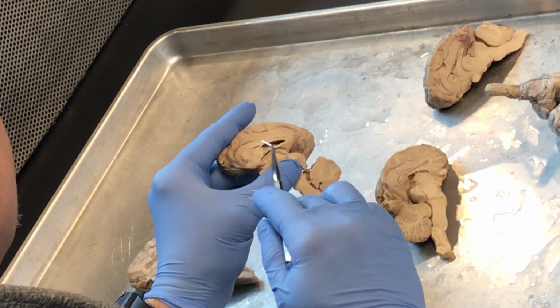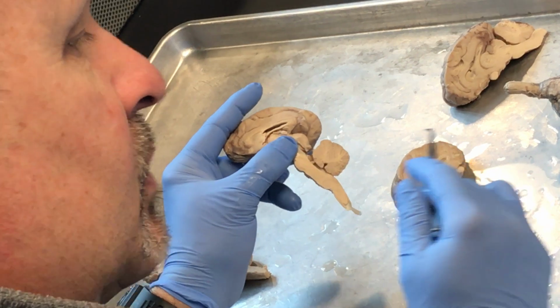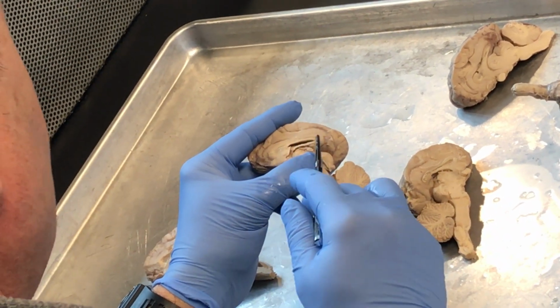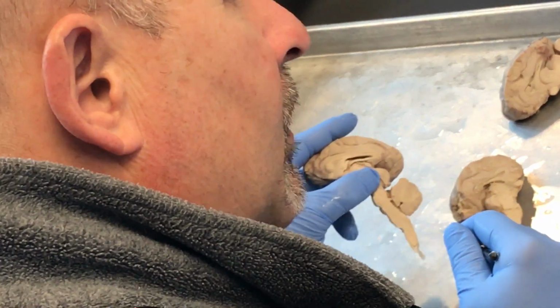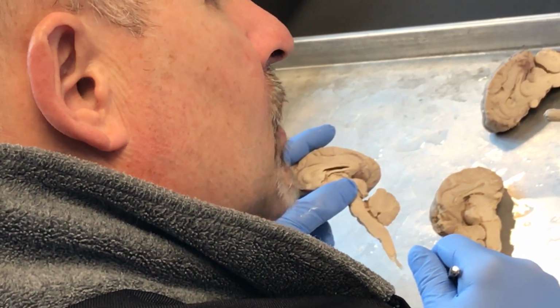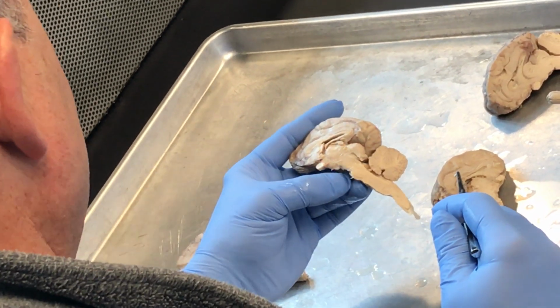So we got corpus callosum right there. Lateral ventricle, we just did that. Fornix, we just did that, the lower lip. Upper lip, corpus callosum, lower lip, fornix. Mouth in the middle, lateral ventricle. Now we want to go to the third ventricle. So 1 and 2, now we want to go to the third one.